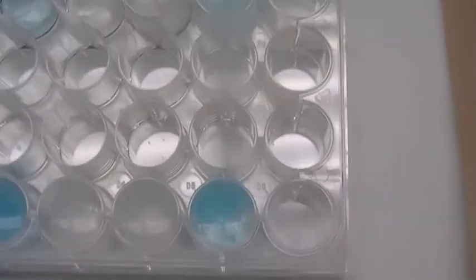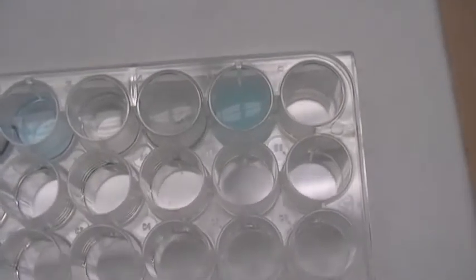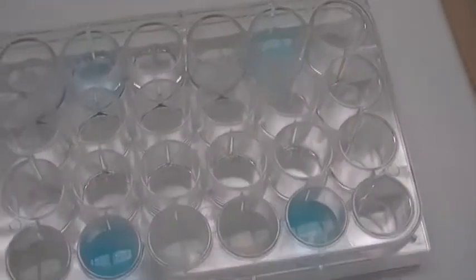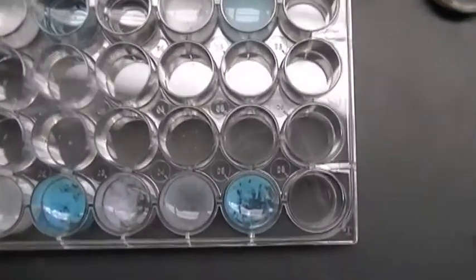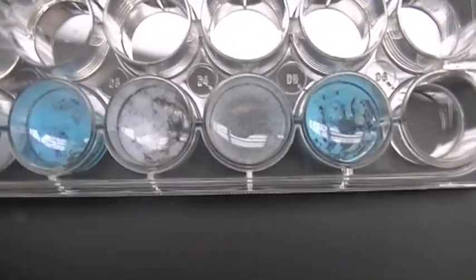All right, so that is it. It says to do it in a test tube. We did it in a spot plate. All right, so you have your observations for that chart. I'm not sure if it's easier to see with a black background. Maybe it is. So you have your precipitates.